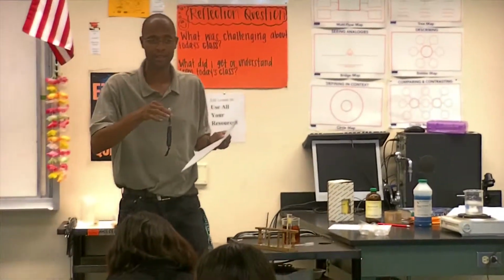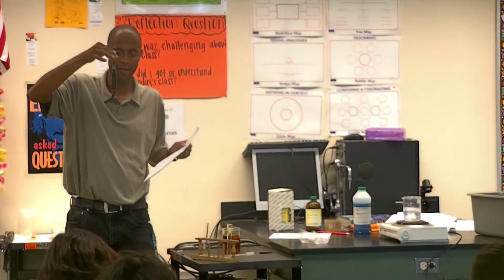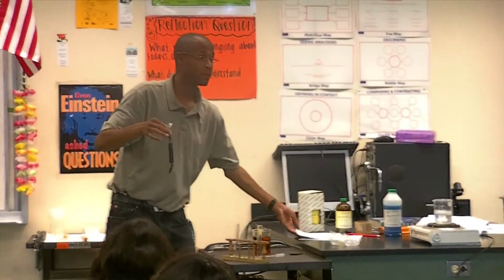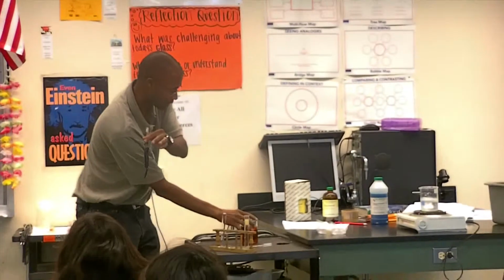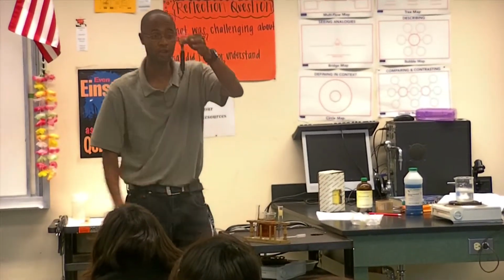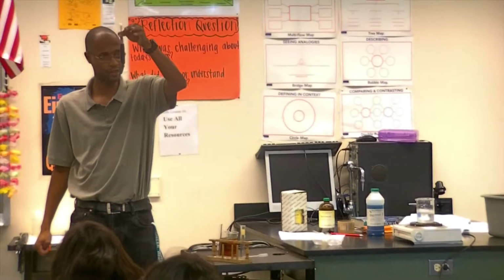Did iodine diffuse through the membrane? Yes. We're on iodine right now. Did it diffuse through the membrane? Yes, it did. We know that. But in the beginning, were there any holes in here? No. There's no trick here. The iodine that was in here went inside, therefore causing the starch to turn black. Selectively permeable, just like our cell membrane.